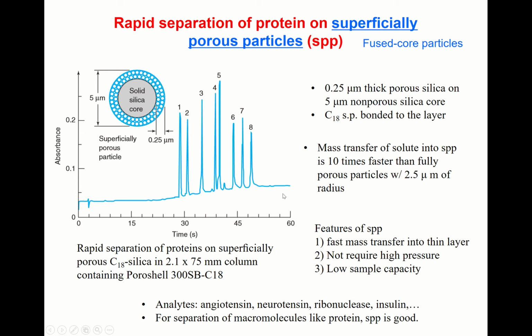Let's look at this chromatogram. Here proteins are rapidly separated on superficially porous particles.